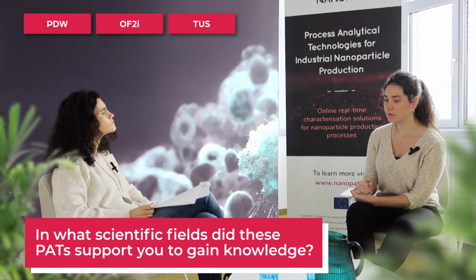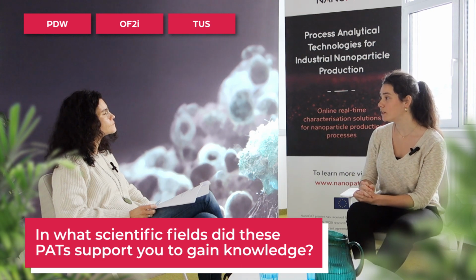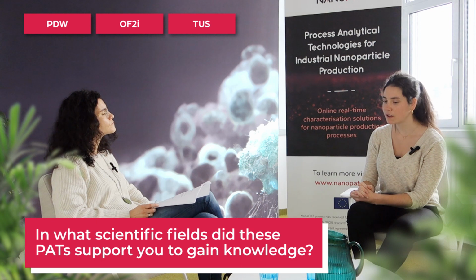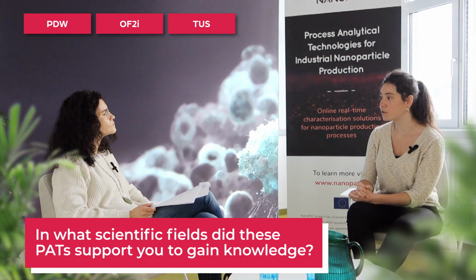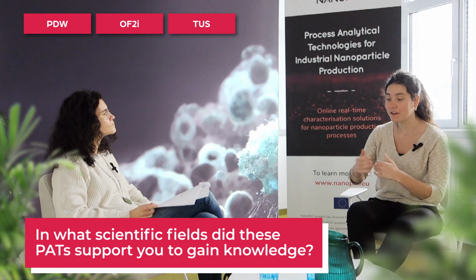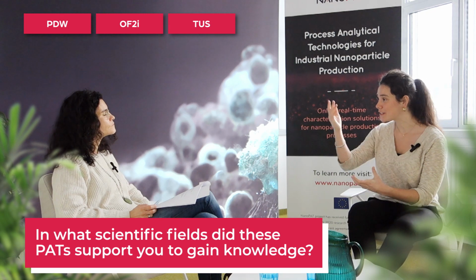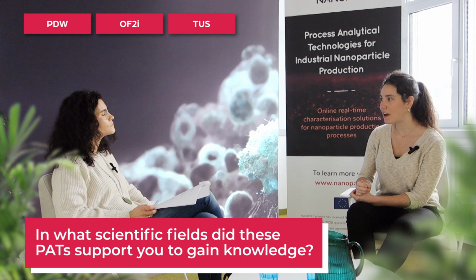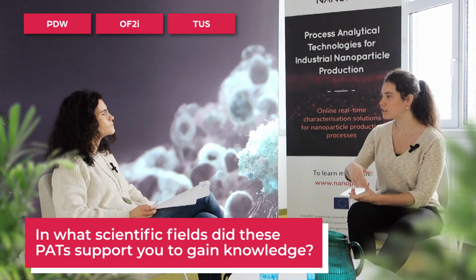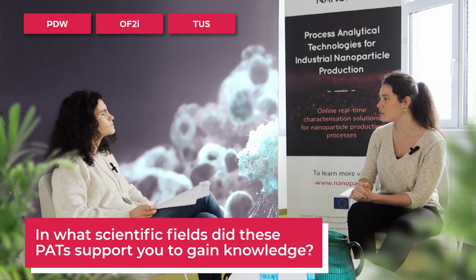So we're able to see not only the particle size increase during the production, but also some phenomena that can occur, because sometimes in principle we have a theoretical, very beautiful, constant particle size increase, but we may have some problems, like for example aggregation, coagulation, creation of new particles, etc. And we have also been testing these technologies to detect this kind of phenomena.